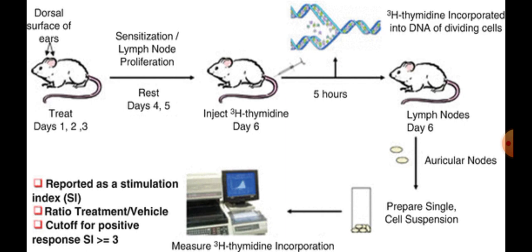and therefore the relative potency of skin sensitizing chemicals is measured by derivation of an EC3 value, this being the concentration of chemical required to provoke a threefold increase in the proliferation of lymph node cells, that is LNC, compared with controls. The procedure from excision of lymph nodes to ATP measurement should be kept uniform for each animal and completed within 20 minutes. The luciferin or luciferase method is applied to measure the bioluminescence in RLU, that is relative luminescence units.